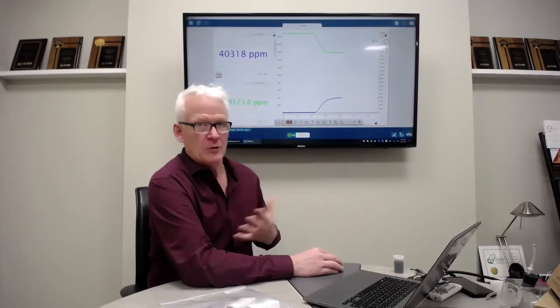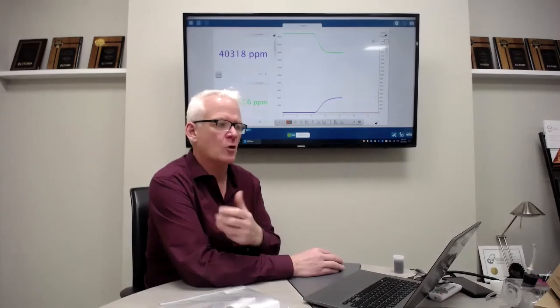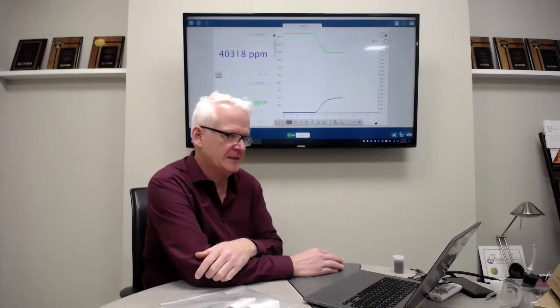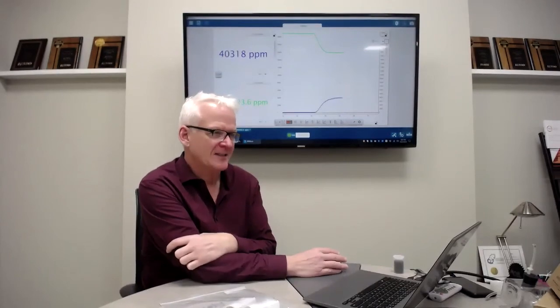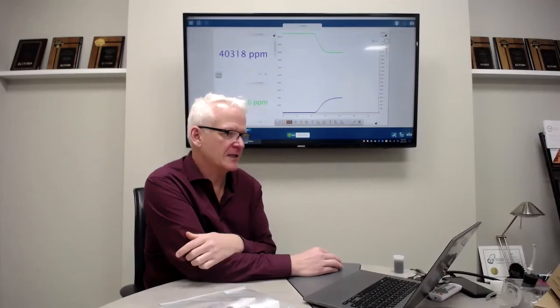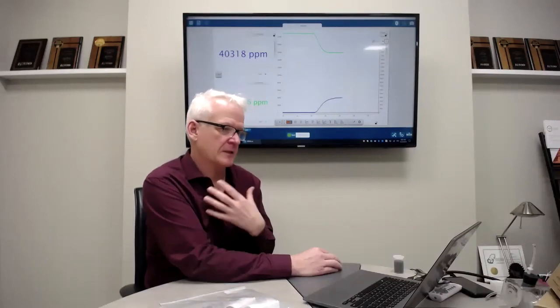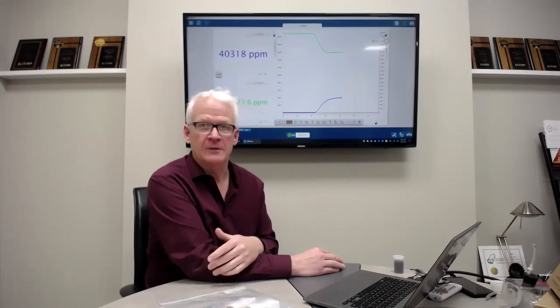When you think of what's going on in your lungs, you would expect some correlation between the two, and it seems pretty close to 1-to-1. At the very least, as expected, when we're breathing we're consuming oxygen and exhaling carbon dioxide, and that's detected by the data we collected here.